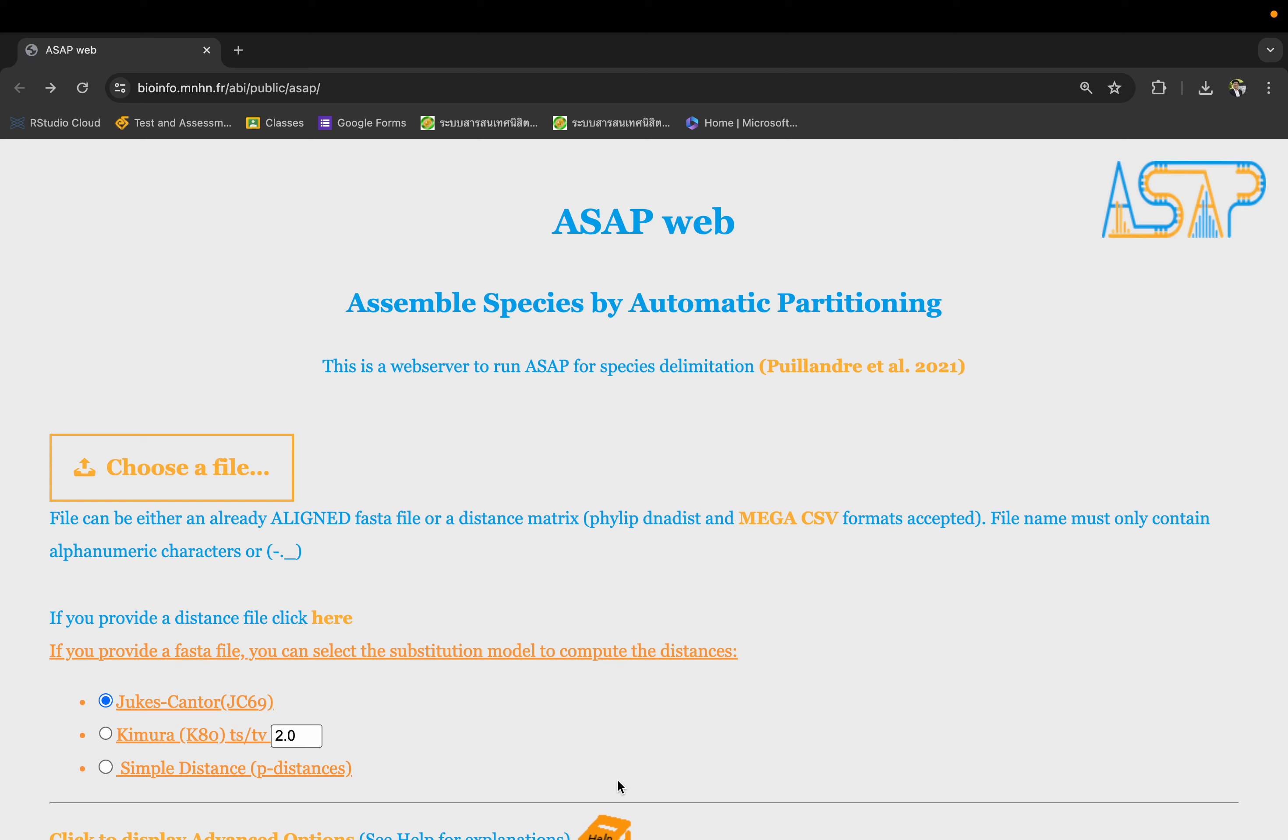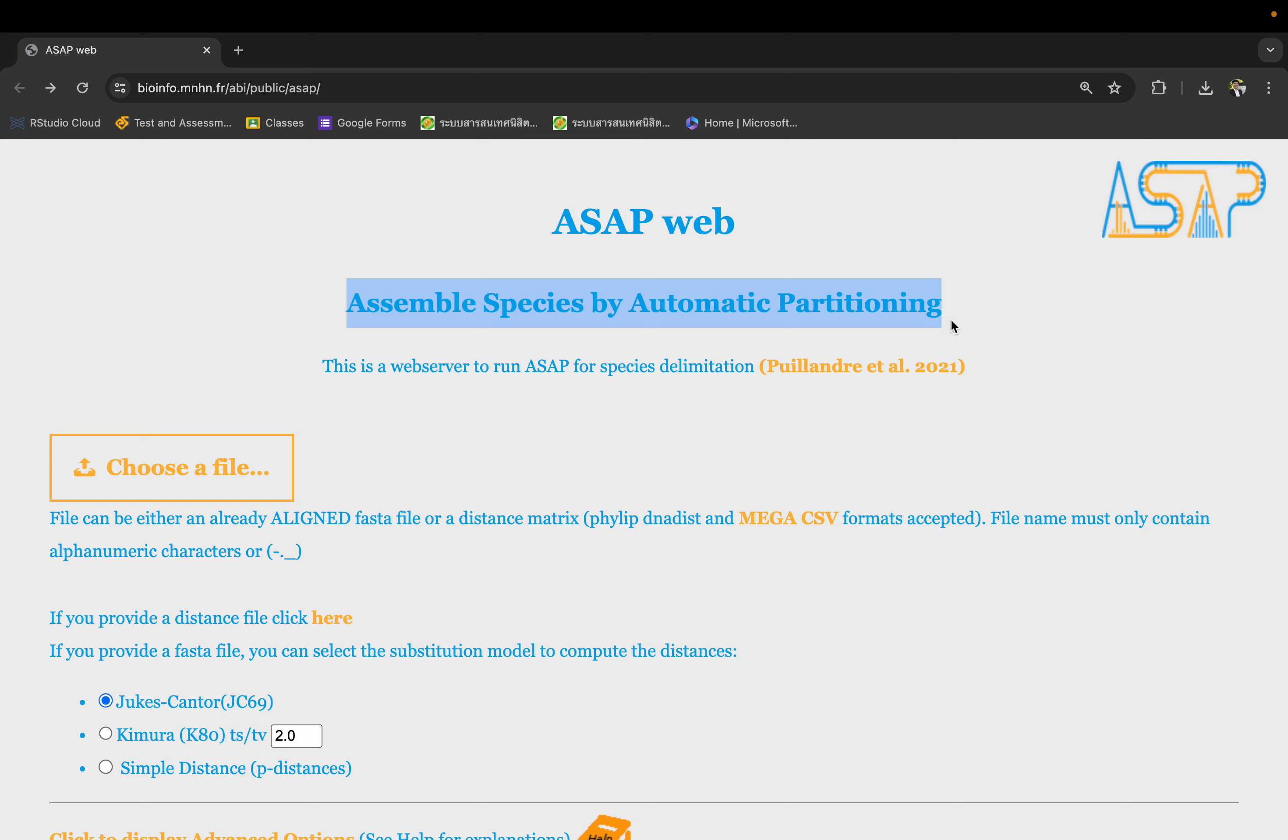In this tutorial we're going to talk about how to use this website called ASAP. It's Assemble Species by Automatic Partitioning. This allows us to cluster sequences that are similar enough to each other and automatically assign species based on the sequence.